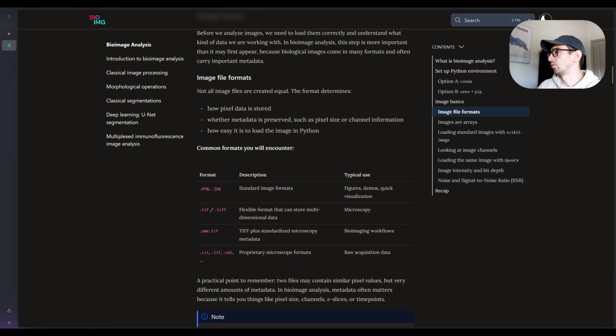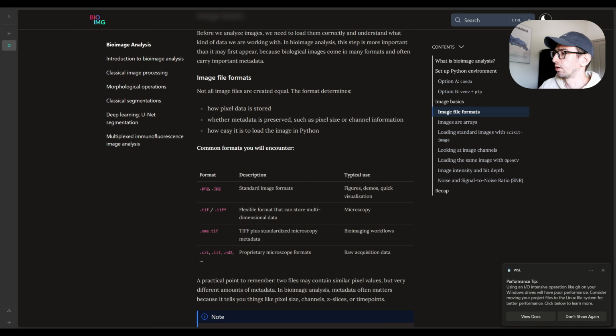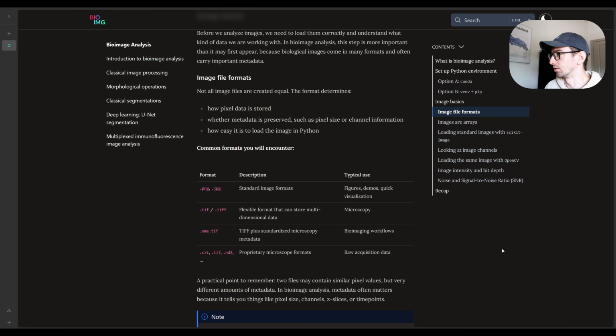Before we start, I just want to highlight that probably all of you already know some types of images. For example, if you want to post an image to Instagram, like this forbidden social network, right, usually you have on your phone an image in the format of JPEG or PNG, something like that. Those are common formats. In biology, bioimaging, we usually have some particular data formats.